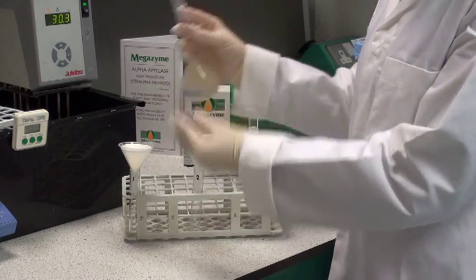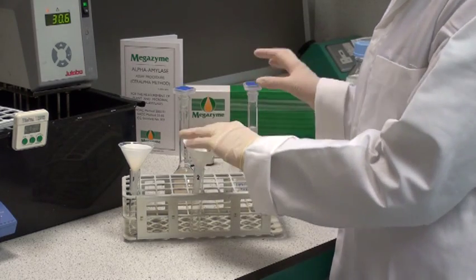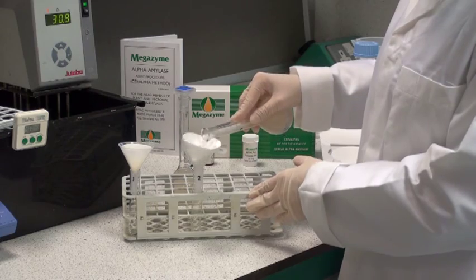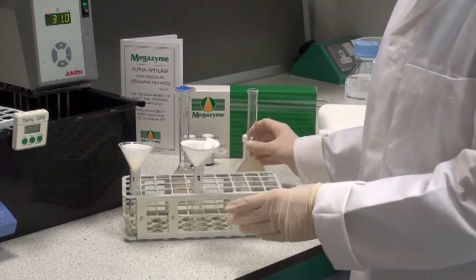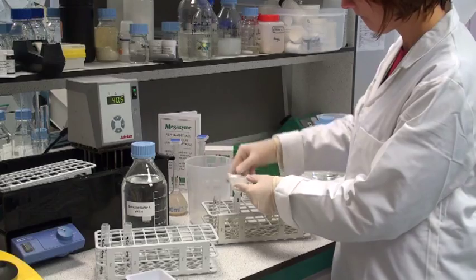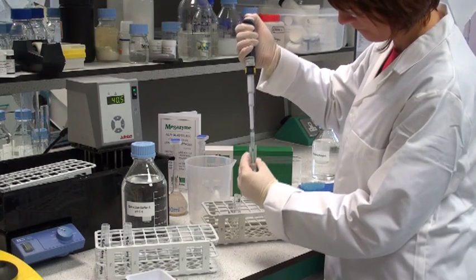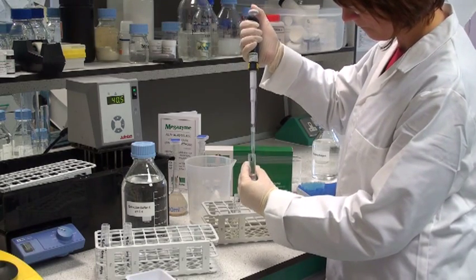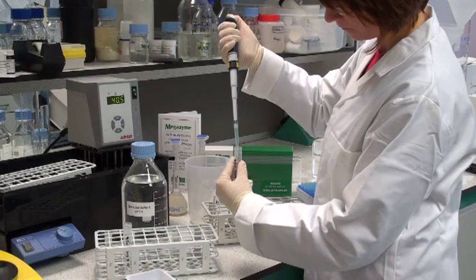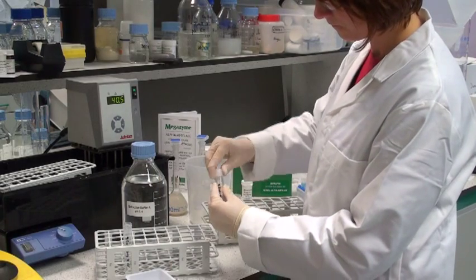Alternatively, at this step, one can centrifuge the sample at about 1000g for 10 minutes. Remove the filter funnels and then accurately transfer 0.5ml of the filtrate to 9.5ml of extraction buffer. Take great care to transfer this solution accurately. Cap the tube and then mix thoroughly.